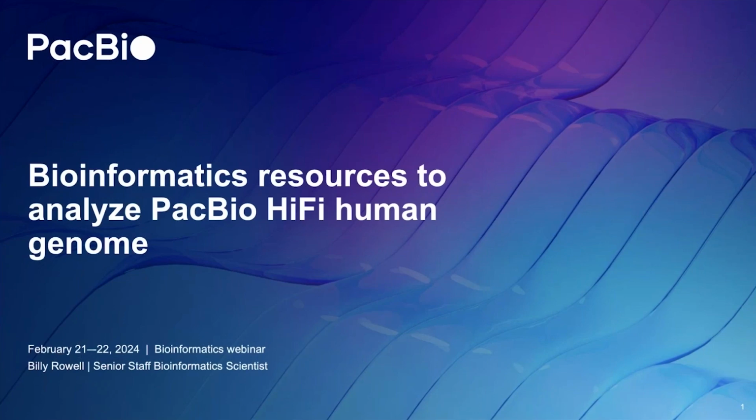Today, I'm going to tell you a little more about the PacBio WGS variant pipeline, including how to set it up, how to run it, what outputs to expect, and what improvements are planned for the next year.